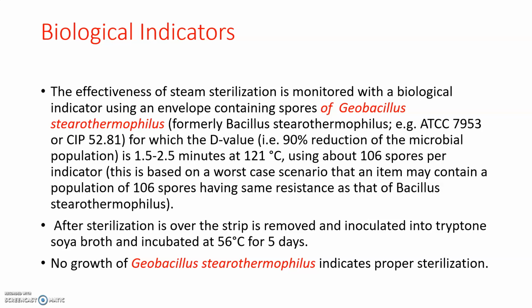After the sterilization is over, the strip is removed and inoculated into tryptone soya broth, and incubated at 56 degrees Celsius for 5 days. No growth of Geobacillus stearothermophilus indicates proper sterilization, and this is how biological indicators are used to monitor the efficiency of steam sterilization.